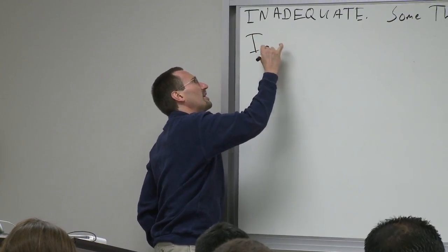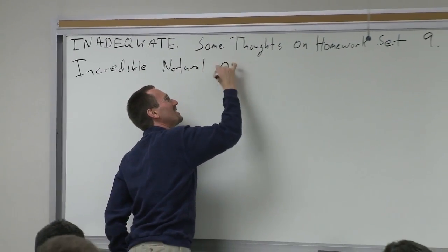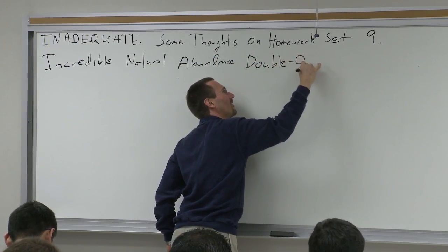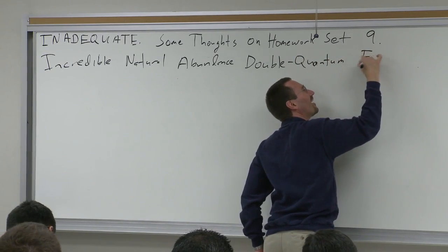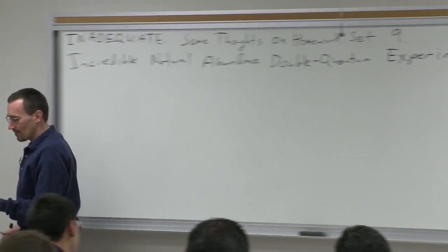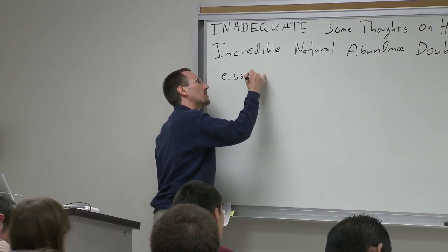It stands for Incredible Natural Abundance Double Quantum Transfer Experiment, and what it is, essentially, is a CC COSY.